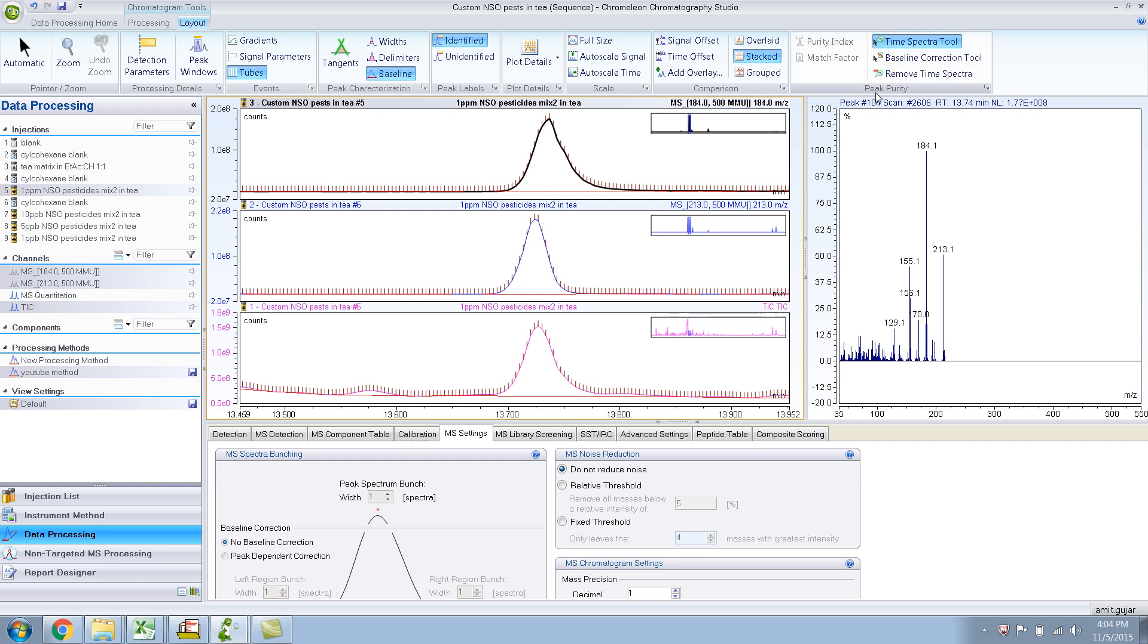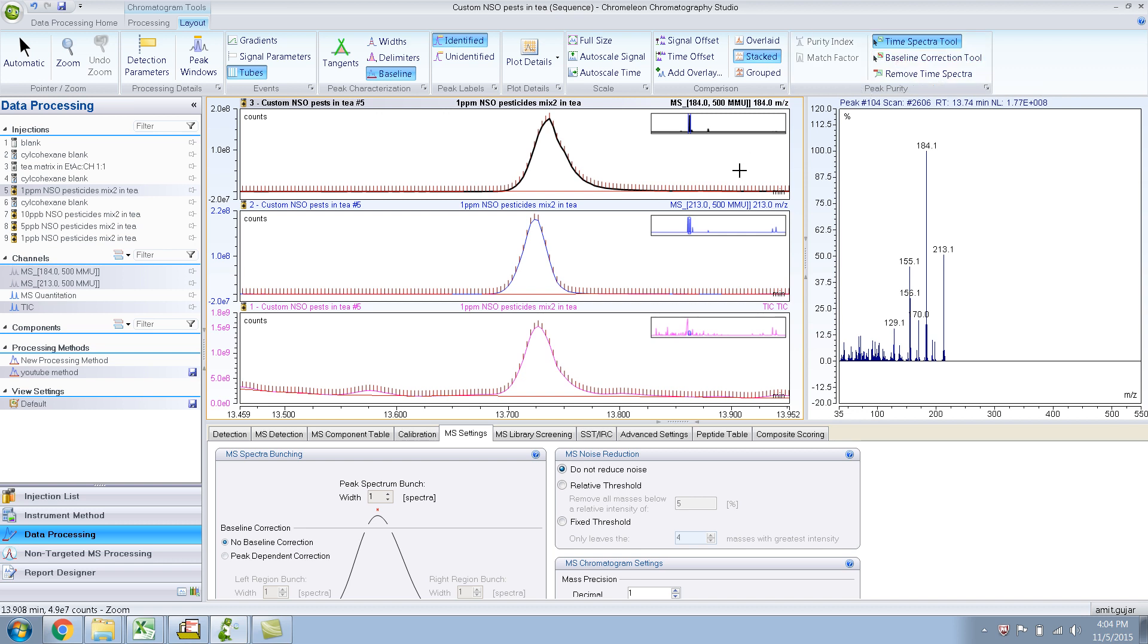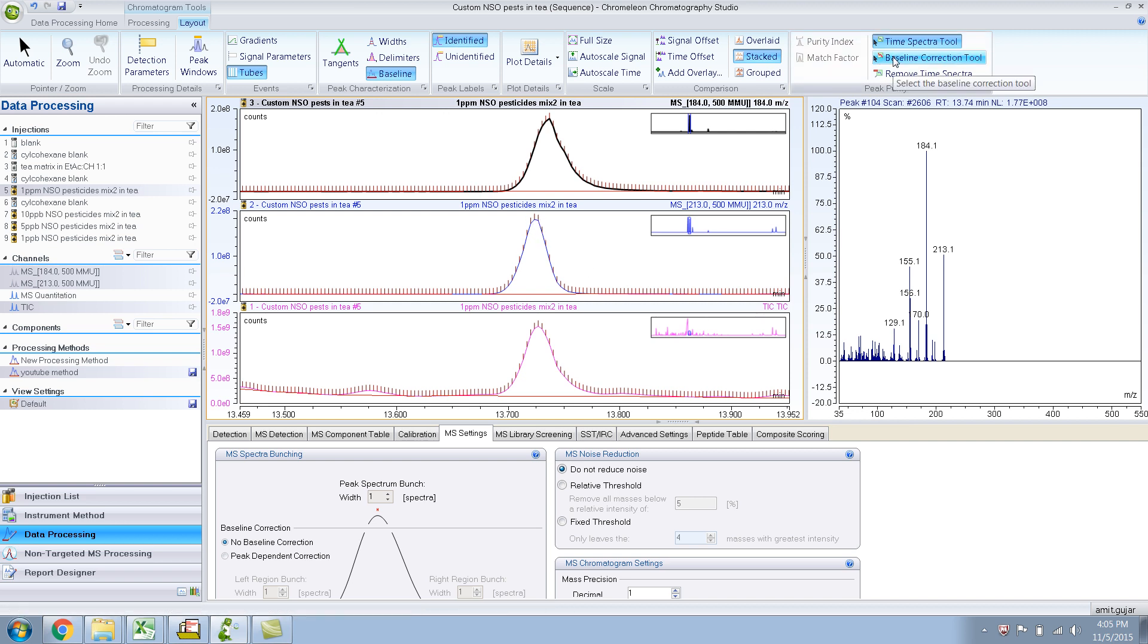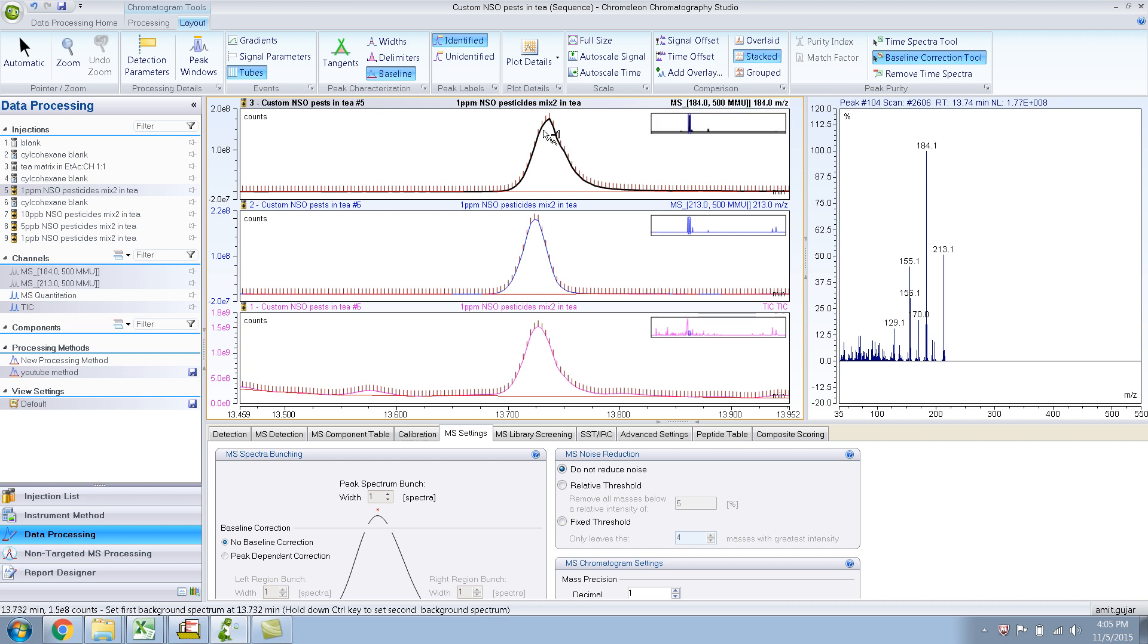And now let me do a baseline correction. So basically what I am trying to do is subtract the mass spectra right next to it, so that it hopefully subtracts out the Cymetrin. So if I do baseline correction, and I say I want to subtract this, there you go.